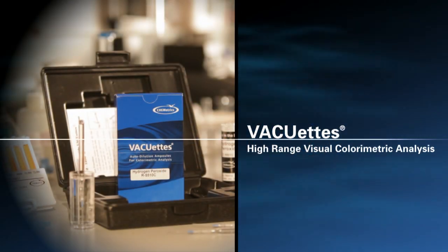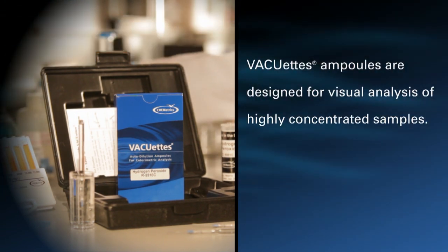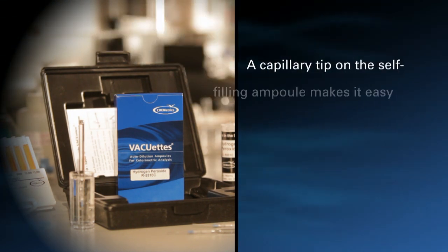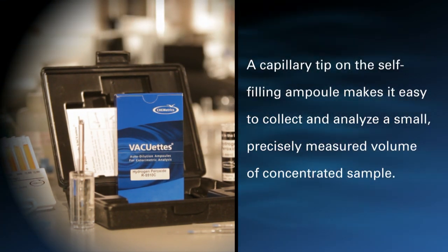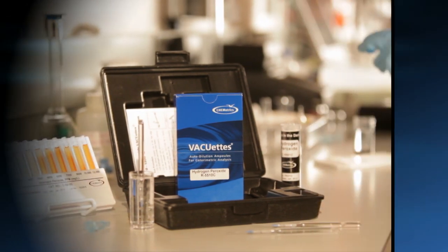VACUETS Auto-Dilution Method for Visual Colorimetric Analysis. VACUETS Ampules are designed for visual analysis of highly concentrated samples. A capillary tip on the self-filling ampule makes it easy to collect and analyze a small, precisely measured volume of concentrated sample.